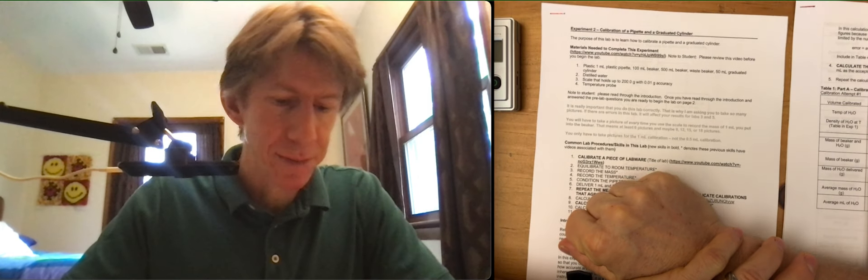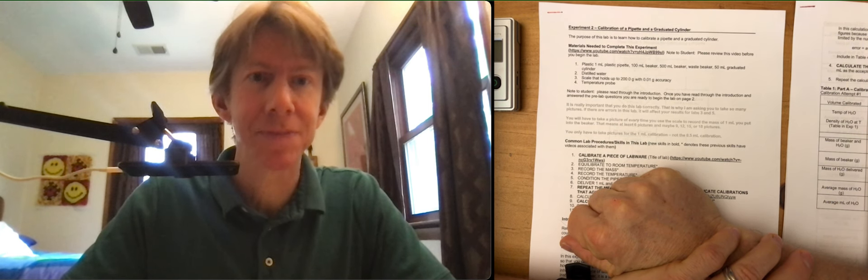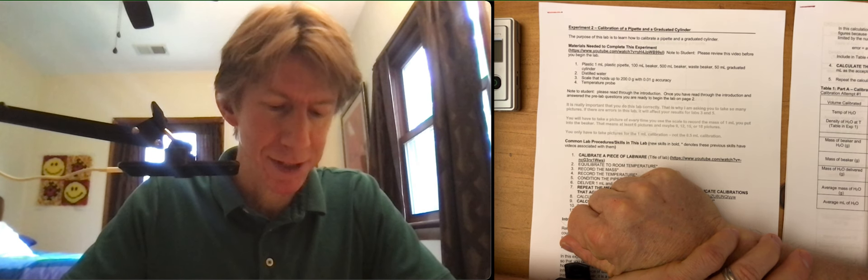Welcome to experiment number two, calibration of a pipette and a graduated cylinder. The purpose of this lab is to learn how to calibrate a pipette and a graduated cylinder. Pretty straightforward as far as the title and the purpose.